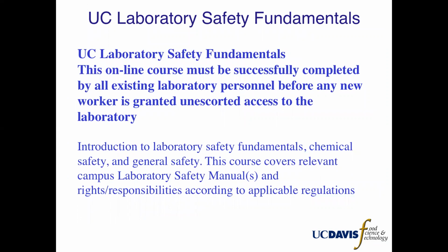UC Laboratory Safety Fundamentals is an online course which must be completed by all laboratory personnel before being given access to the laboratory. It is an introduction to laboratory safety fundamentals, chemical safety, and general safety. It covers relevant information discussed in the UC Davis Laboratory Safety Manual and rights and responsibilities according to applicable regulations.